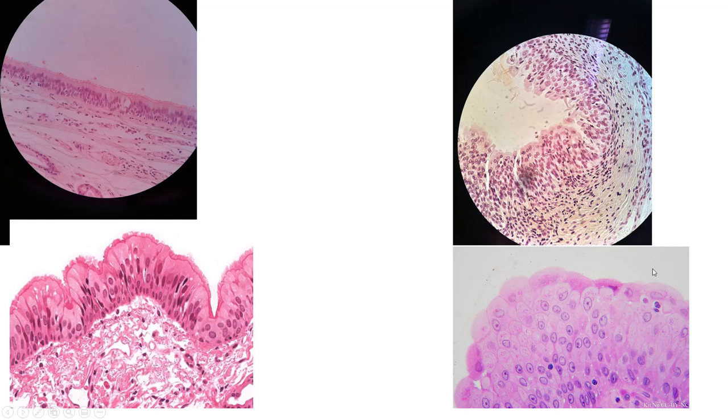Here we have transitional epithelium. So nice rounded cells on the surface. This means it's in a non-stretched out state. Same thing here. We find this in the urinary bladder. So transitional epithelium in the urinary bladder.